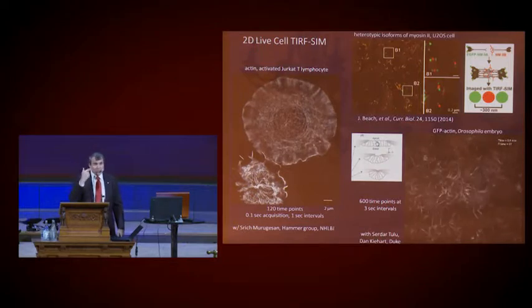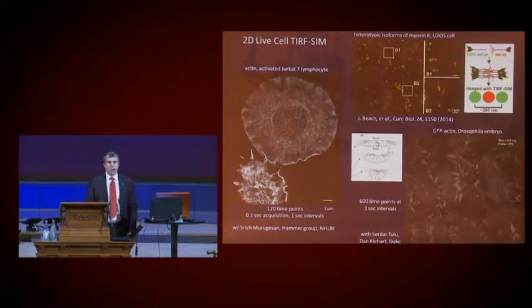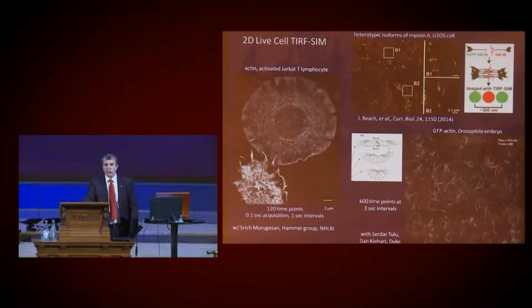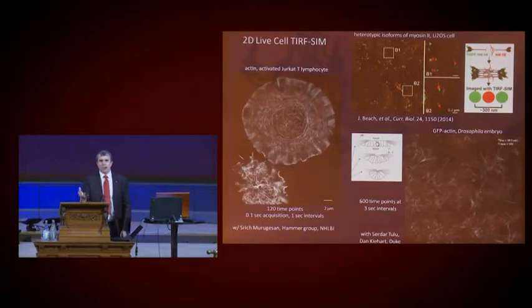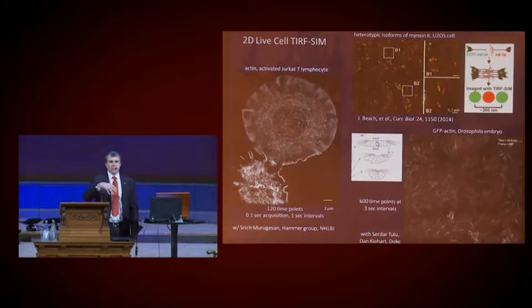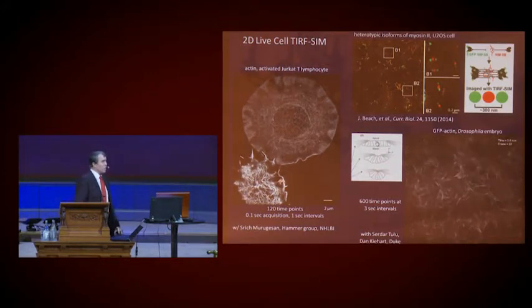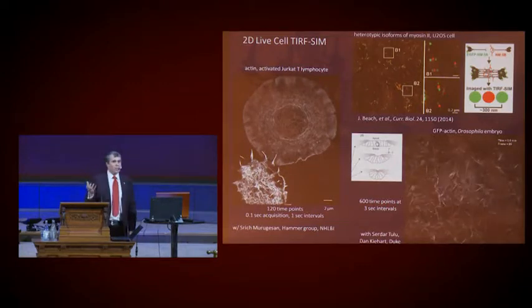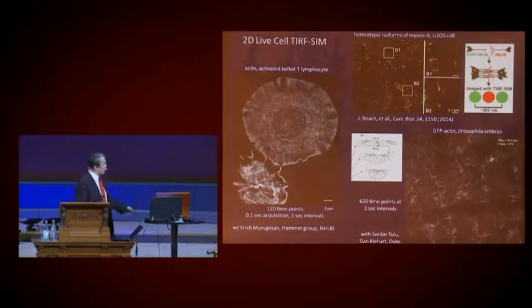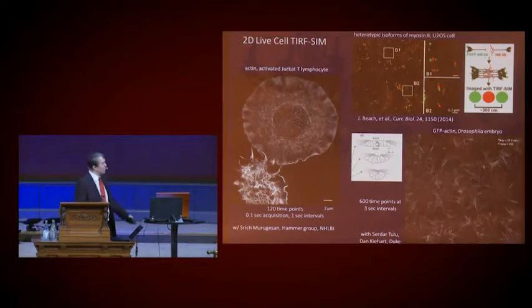But honestly, we've had many, many groups come to our lab to use all of our microscopes, and on the SIM scope, what most people have gravitated towards is the TIRF mode, where you just see the very bottom of the cell because it's fast and because you're not limited by out-of-focus fluorescence. This is an example of looking at the immunological synapse of a T cell presented against an antigen-presenting coverslip. You can take up to 10 frames per second, so you can look very quickly.